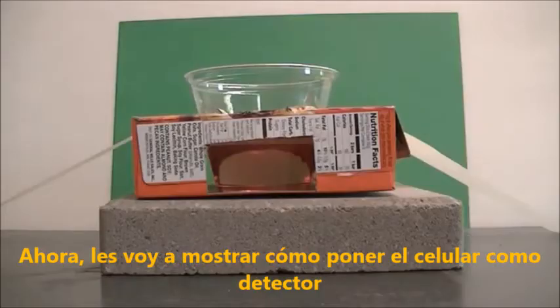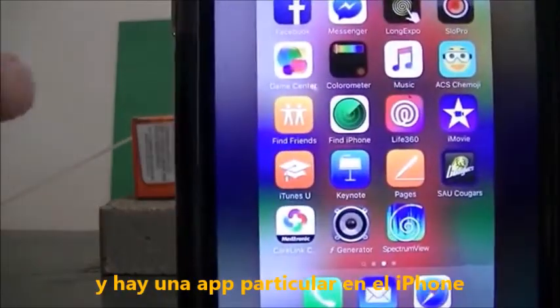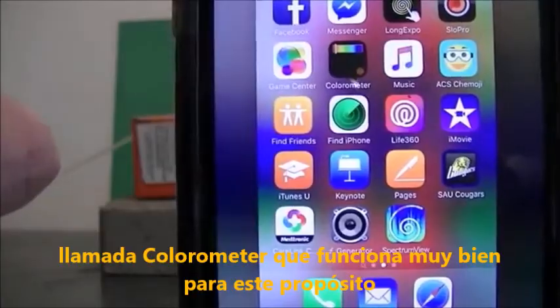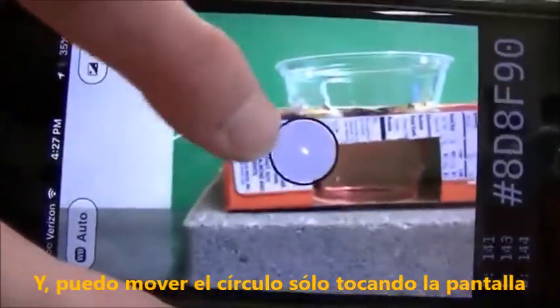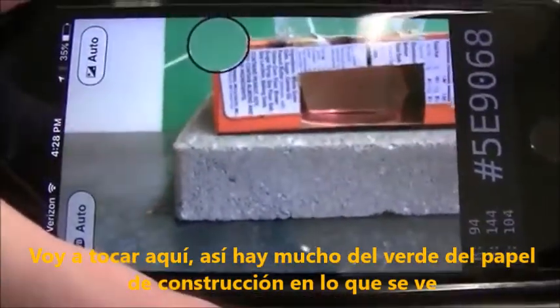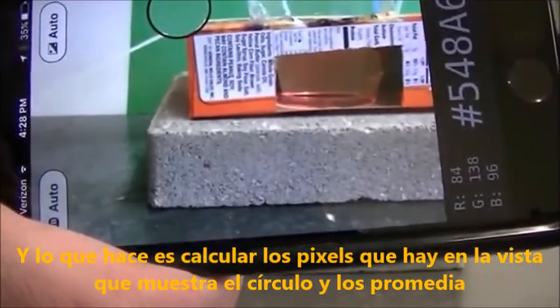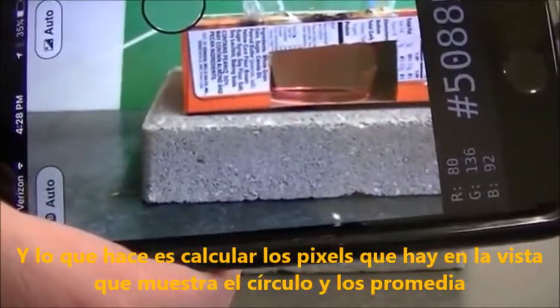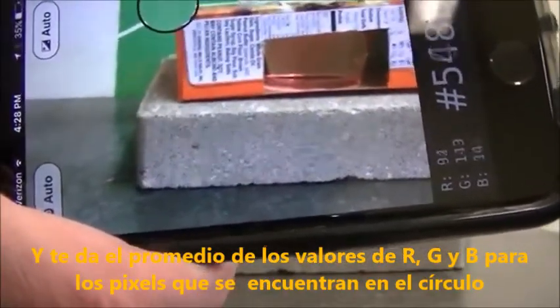Now I'm going to show you how to set up the cell phone as your detector. I'm using an iPhone with an app called Colorometer, which works very well for this purpose. When you open Colorometer, a screen shows up and you can move a circle by tapping the screen. It takes the pixels in the circle view, averages them, and gives you the average R, G, and B values for those pixels.